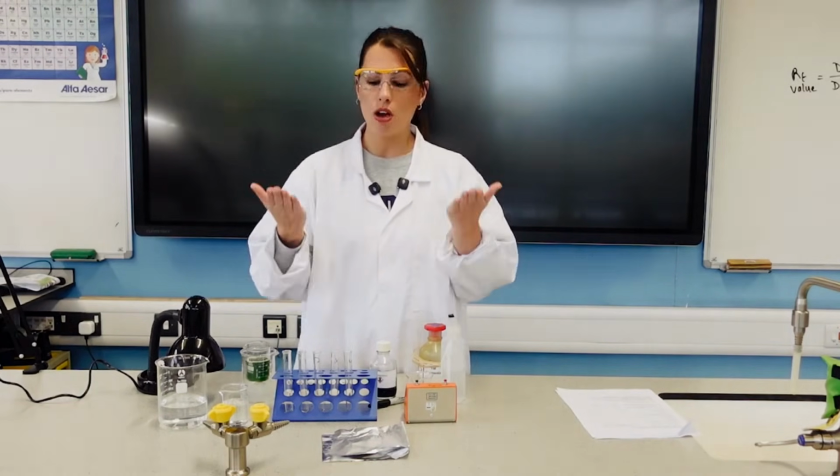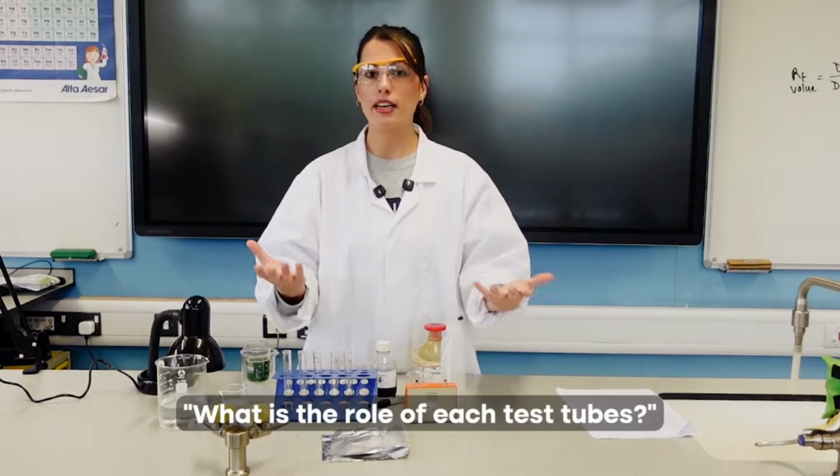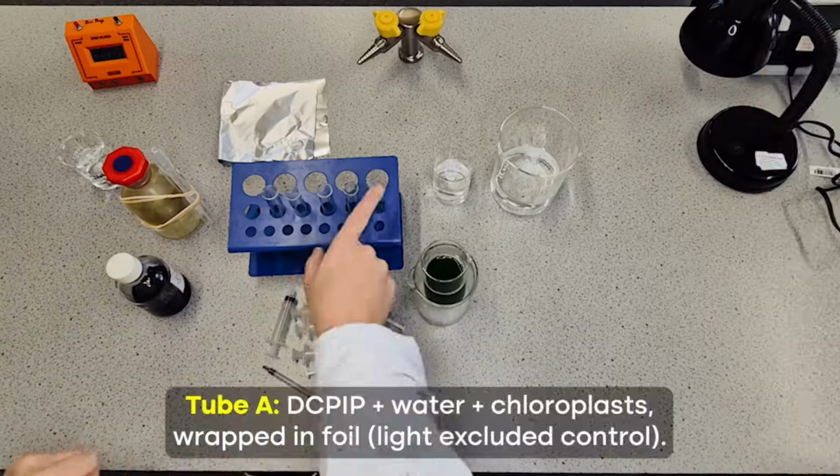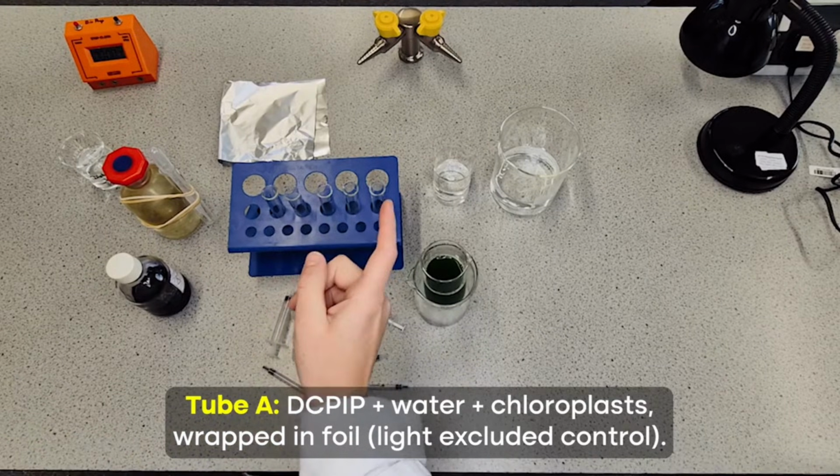So I'm going to set up all of these test tubes, and as I set up each one, I'm going to talk you through the role of each test tube so you can then explain that to your students. So we're going to set up the different test tubes, starting with test tube A, which is one of our control tubes.